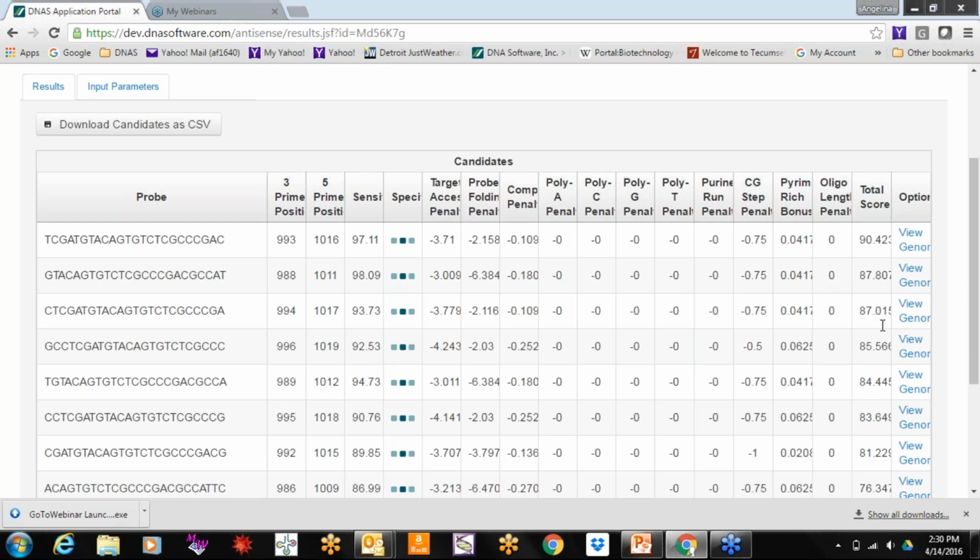I'm going to scroll up. So it looks like one of the questions is, can this be best used for microarray probe designs? Could you use it in a microarray capacity? I imagine surface corrections or other. The microarray probe designs would, I think, be a specific application, and that would be something that we could build.